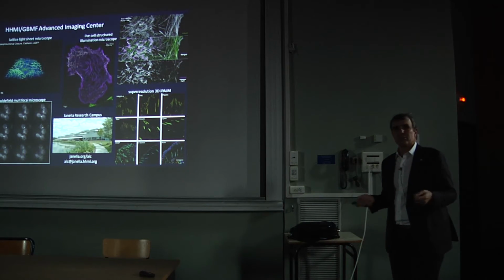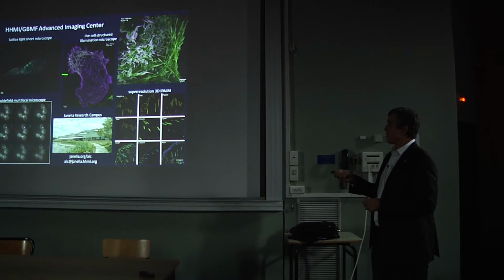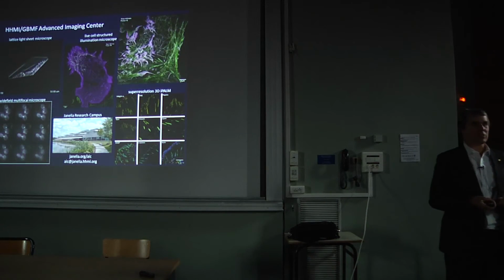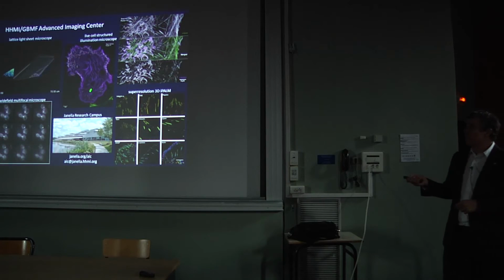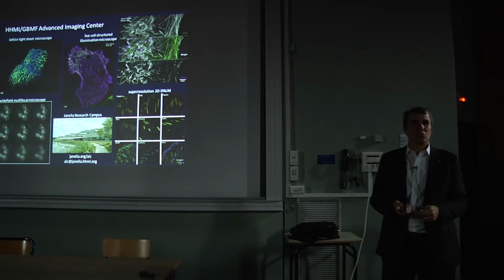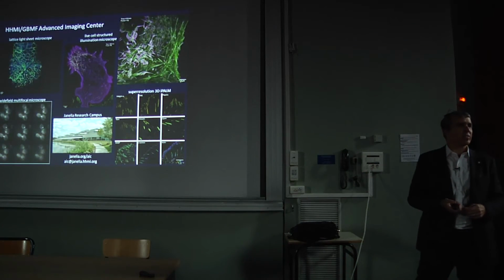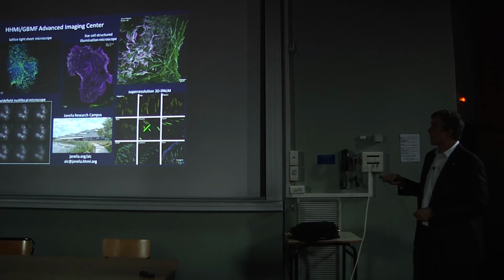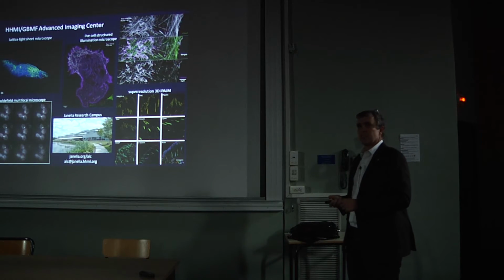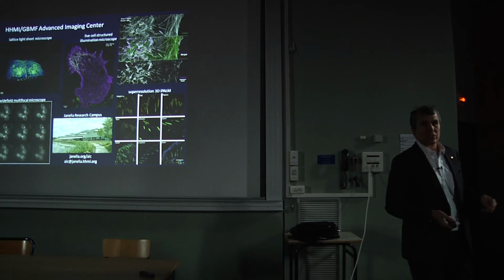And then finally, commercialization. So PALM has been commercialized for ages. While there are many commercial implementations of SIM, I don't think any of them are as good as what SIM should be. And so we're trying to make sure that people have access to being able to build the SIMs. And it's really quite cheap and fairly easy to build a SIM. And the lattice light sheet, you can now buy clones of what we have from a small company that has a sub-license called 3i.